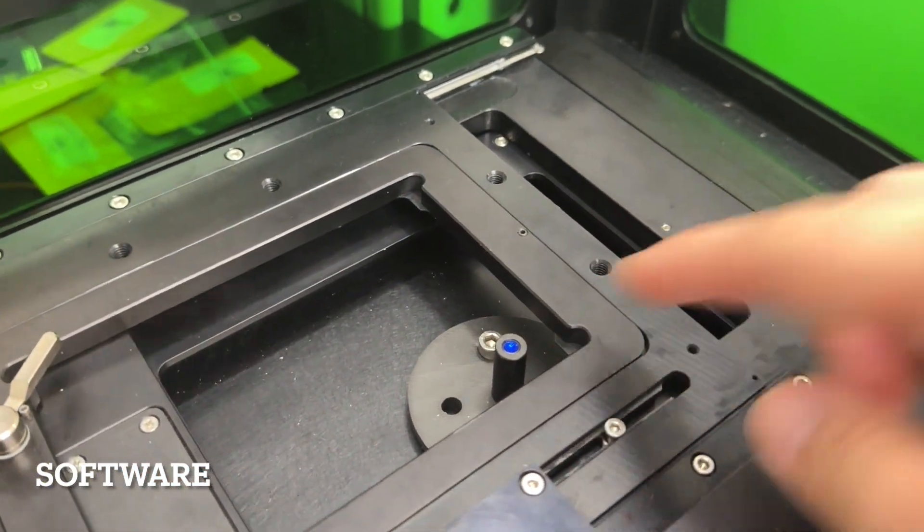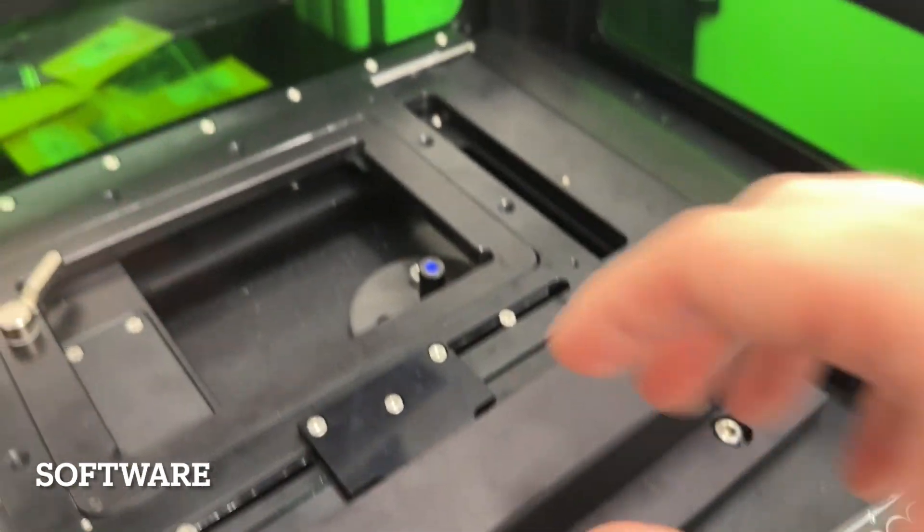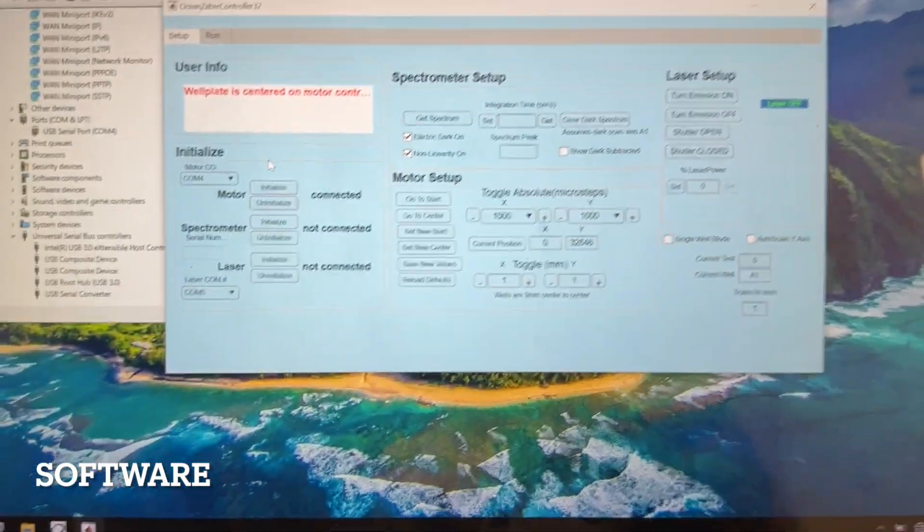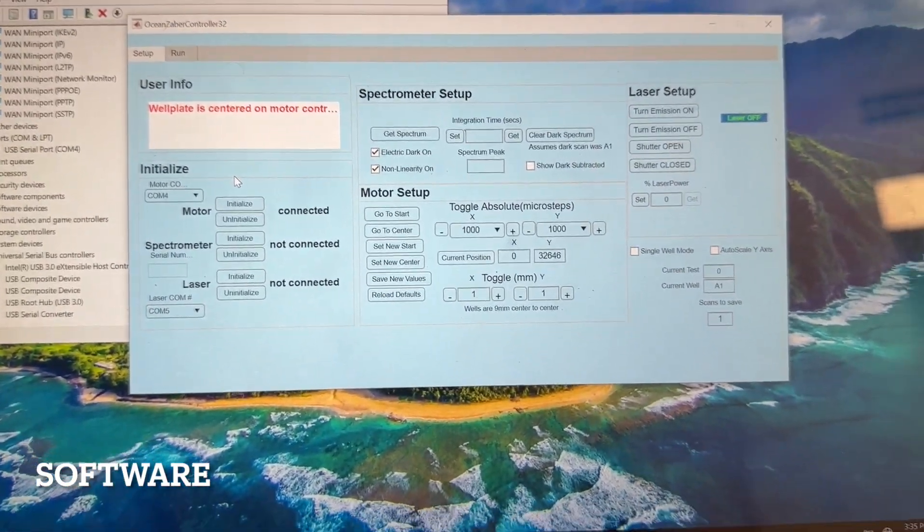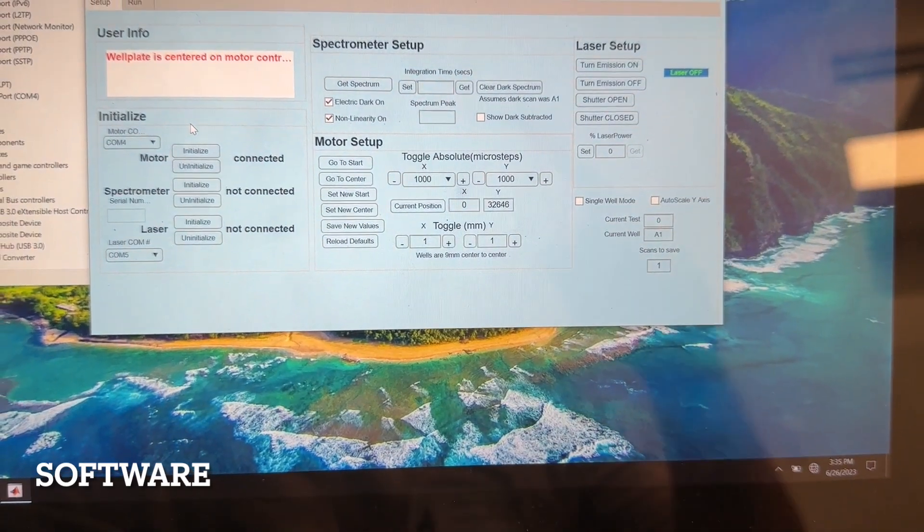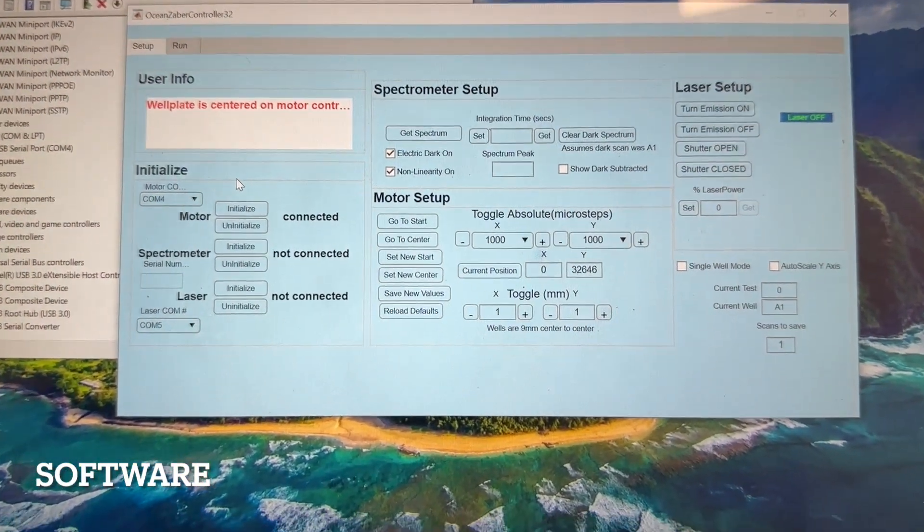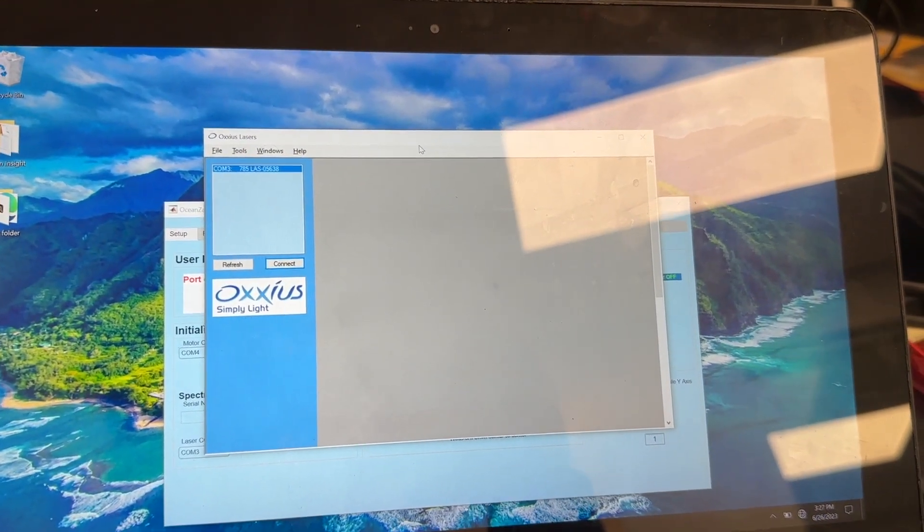The samples will be in this little well plate and then the well plates will be above this laser. The laser will shoot through the sample and the camera will capture the image. And eventually the image will be translated through Fourier transforms to be able to get peaks at certain frequencies depending on what is in that sample.